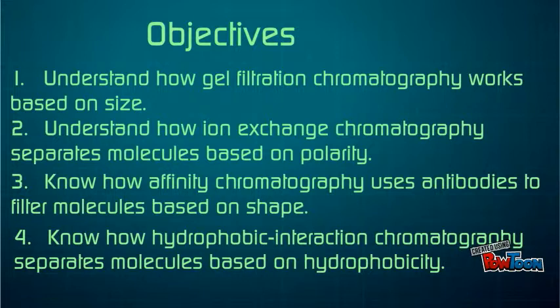1. Understand how gel filtration chromatography works based on size. 2. Understand how ion exchange chromatography separates molecules based on polarity. 3. Know how affinity chromatography uses antibodies to filter molecules based on shape. And 4. Know how hydrophobic interaction chromatography separates molecules based on hydrophobicity.